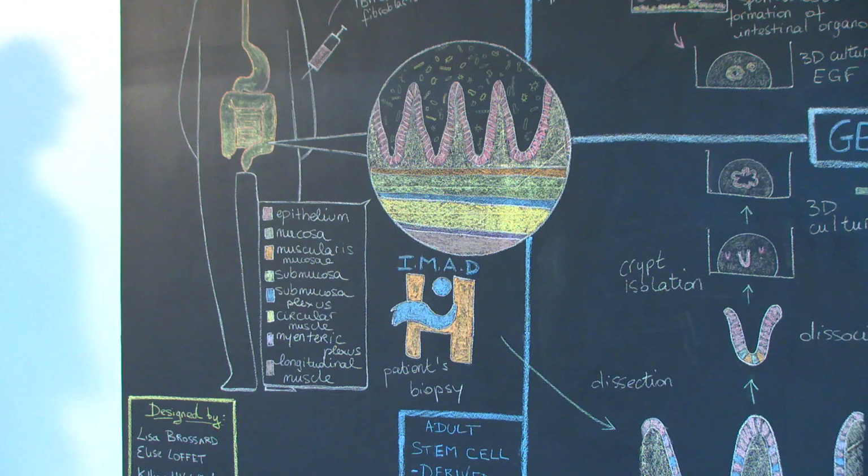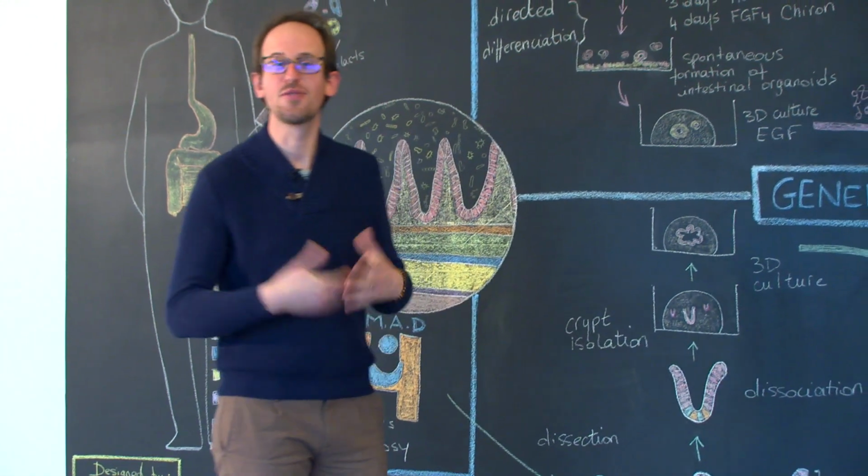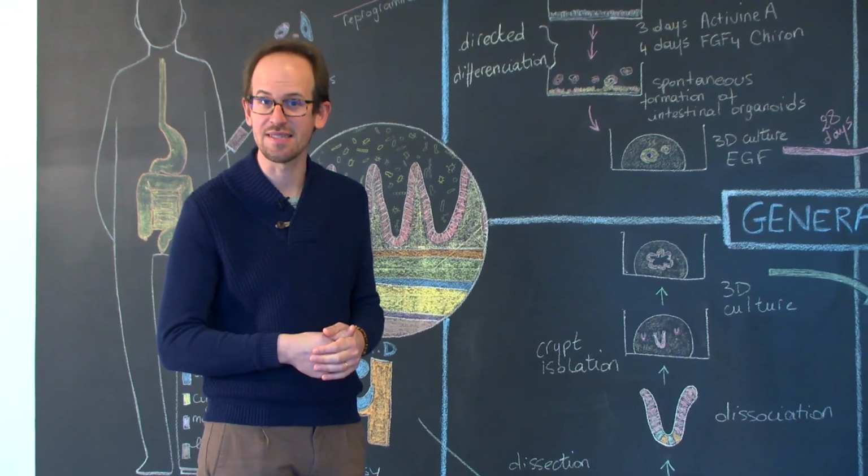I'm a researcher at Inserm, and today we're going to present to you how we can use stem cells and intestinal organoids to study intestinal physiology and diseases. So how can we use organoids to study intestinal physiology and disease?